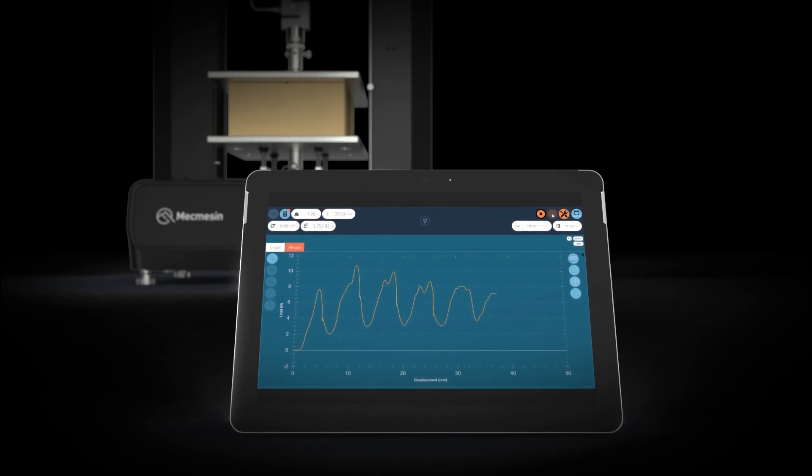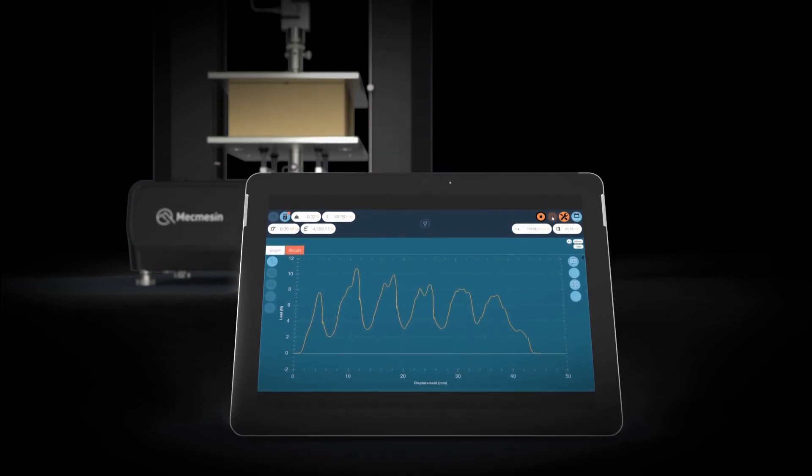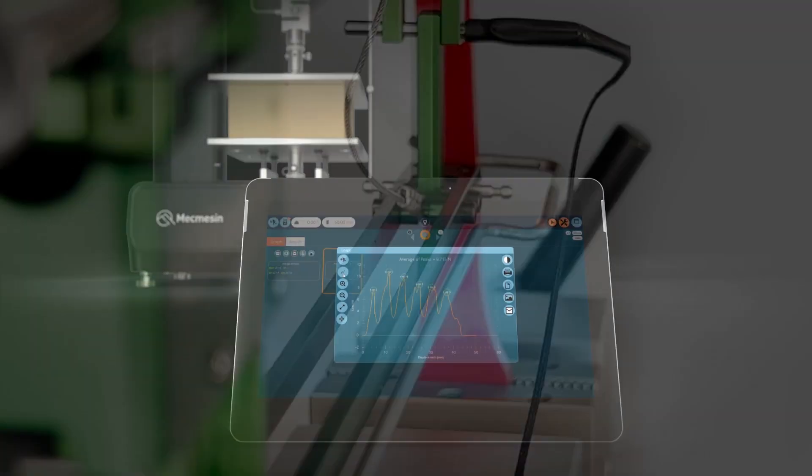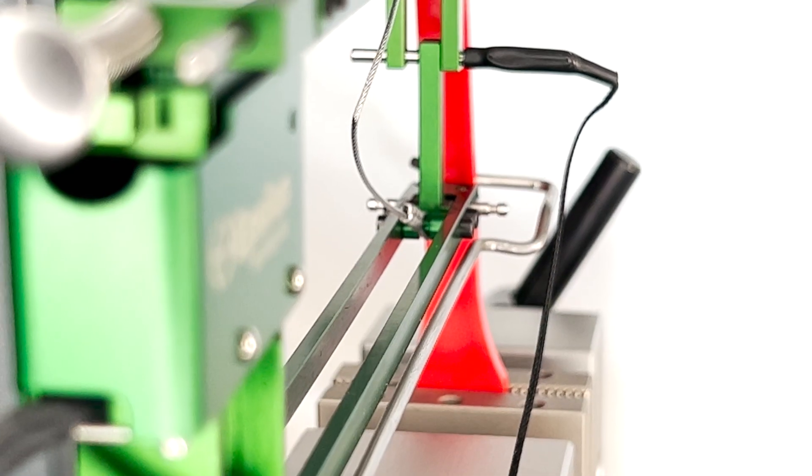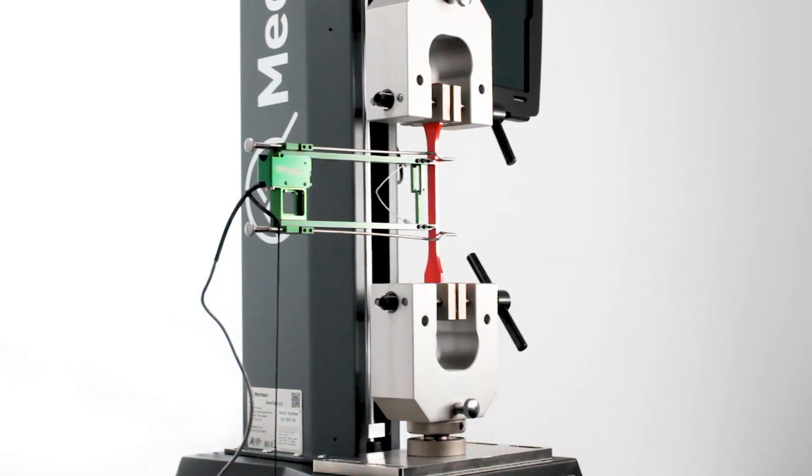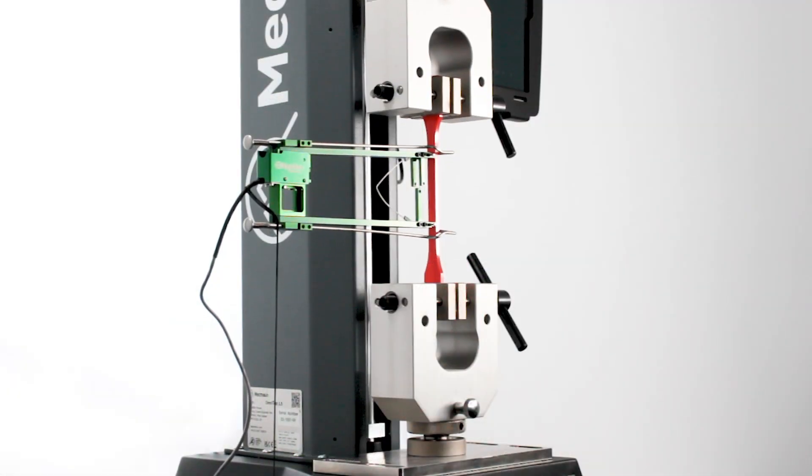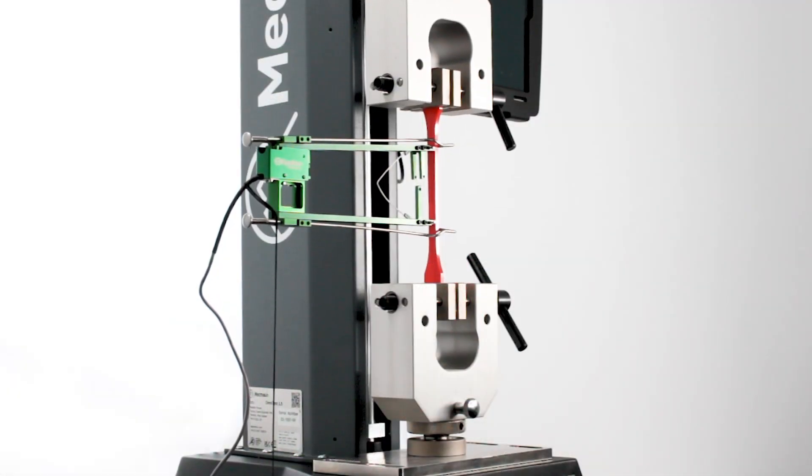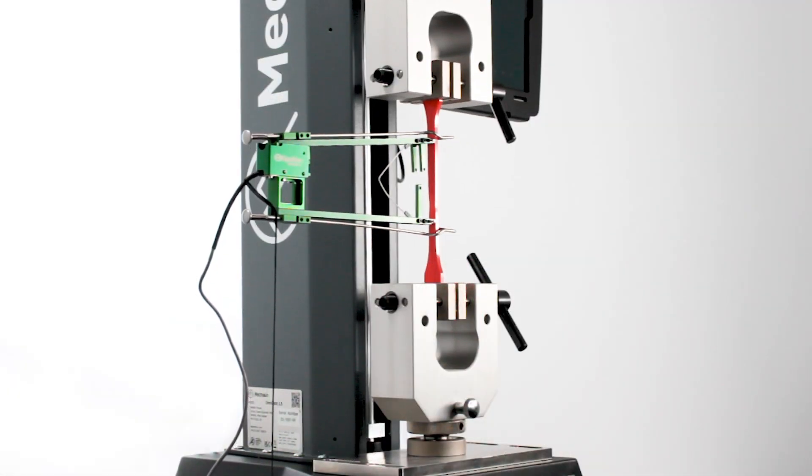For enhanced accuracy when testing the elongation of materials, Omni test universal testing machines can be fitted with a selection of precision extensometers.